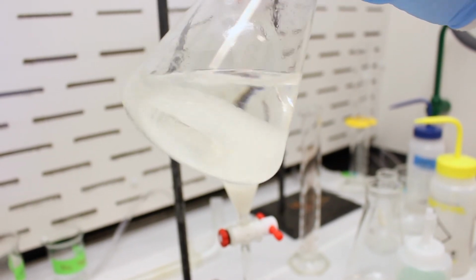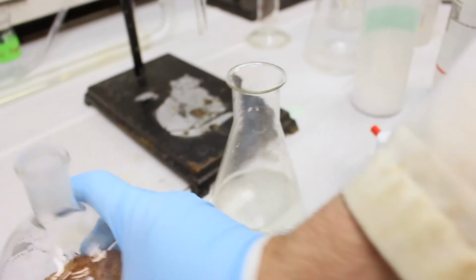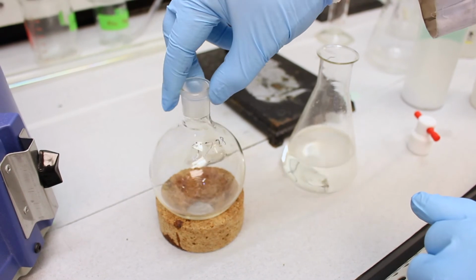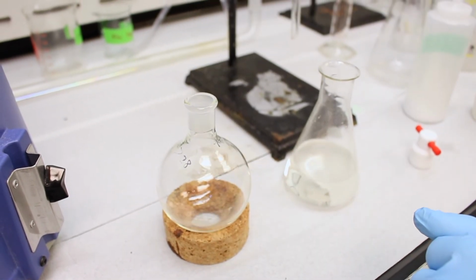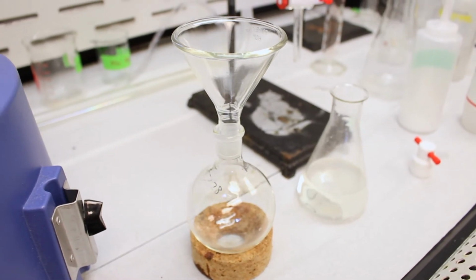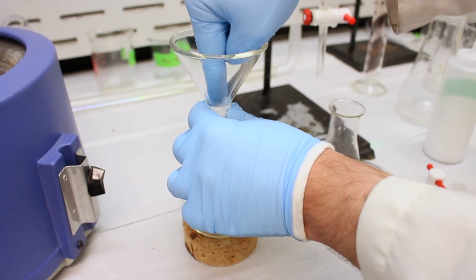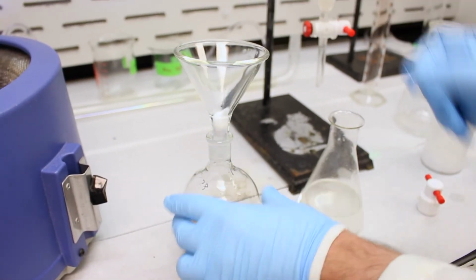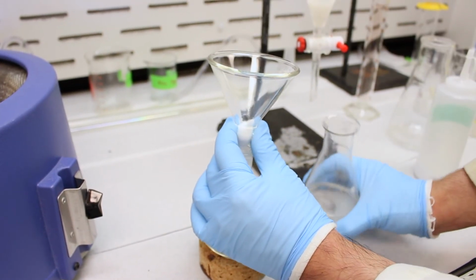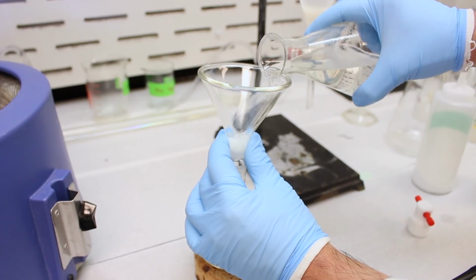So now that we have a dry solution, which means it's free of water, we can take our flask. I've written the weight of the flask right here, so it's 97.28 grams. Now we can take a funnel and some cotton, and we can filter the mixture. Now this might be a little bit challenging because it might form a seal, so I'll lift it out a little bit. And we're going to filter the sodium sulfate away.